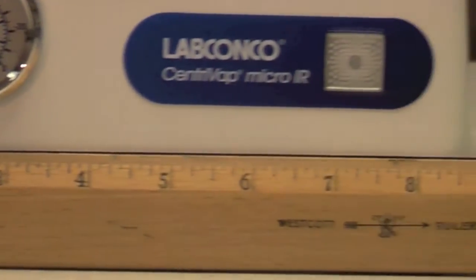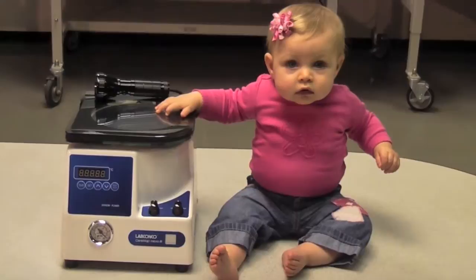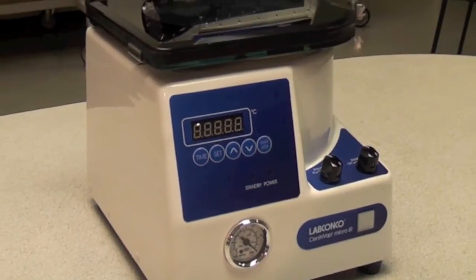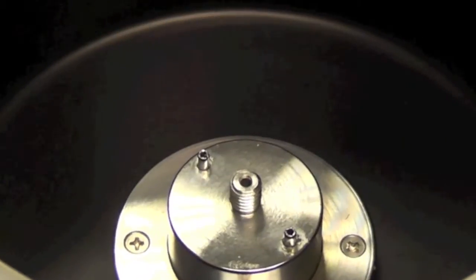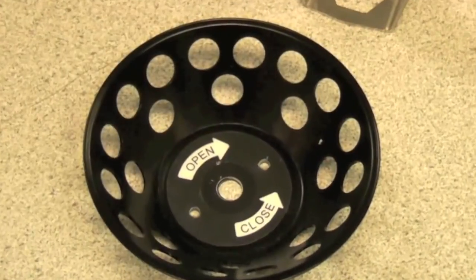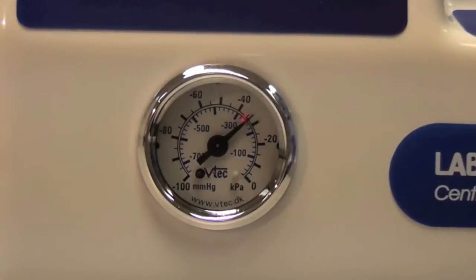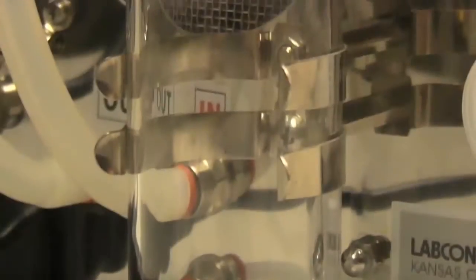Everything about the CentriVap Micro-IR is small, except its many features. Everything is included with the IR, including the Teflon-coated chamber, diaphragm vacuum pump, rotor, vacuum gauge, glass trap, and strobe light.